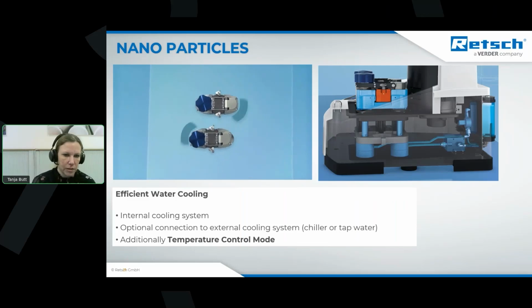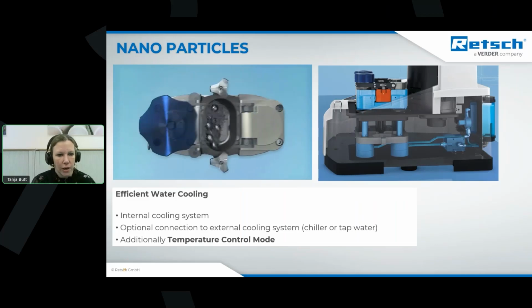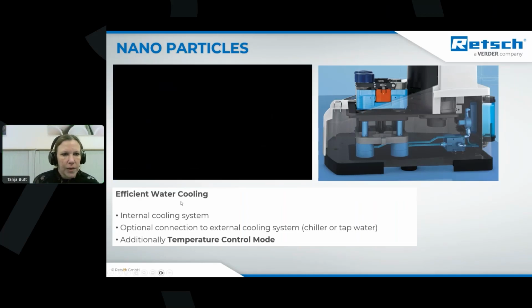And you get at the same time friction and impact events. Yeah, mixer mill is more impact, planetary ball mill is more friction based, depending on the ball size and the filling degree. But here you have both effects at the same time, and this leads to a very, very high capacity to crush samples, and also the 2000 RPM, of course.